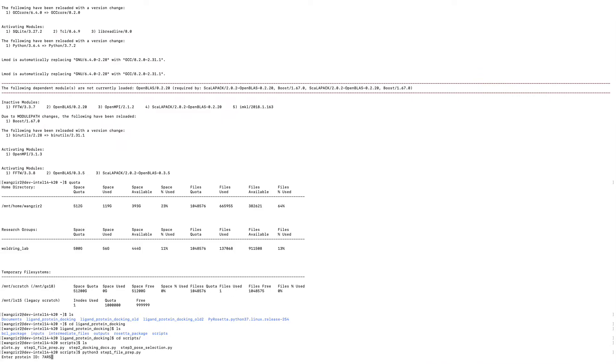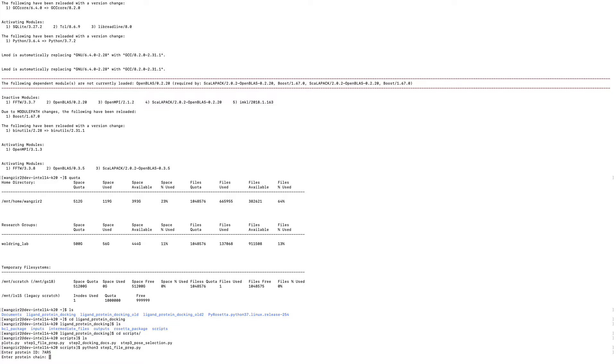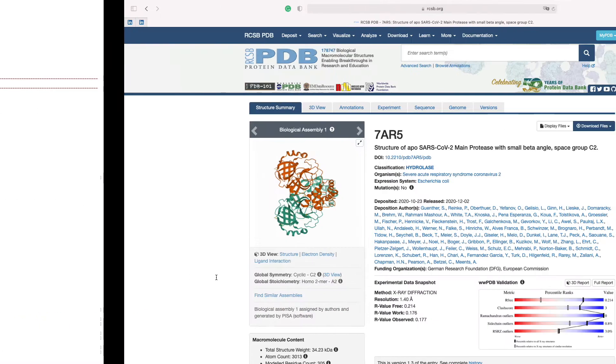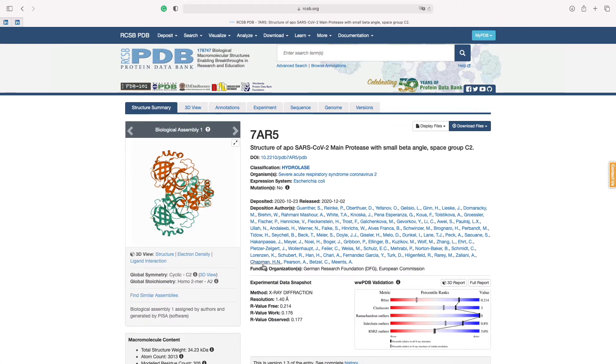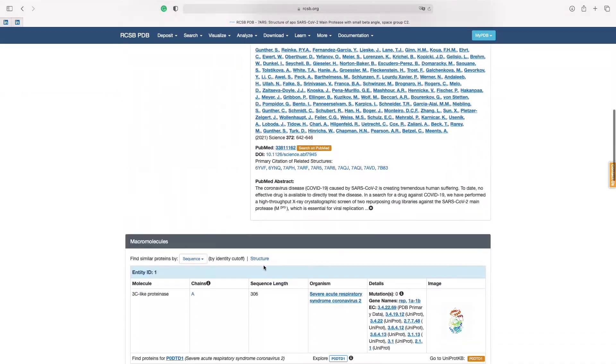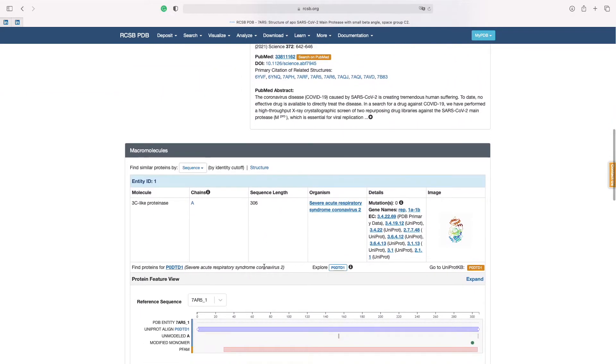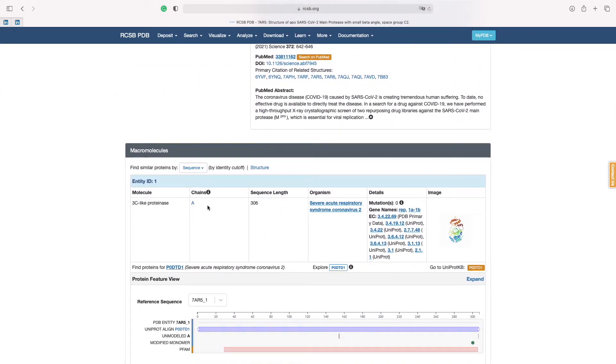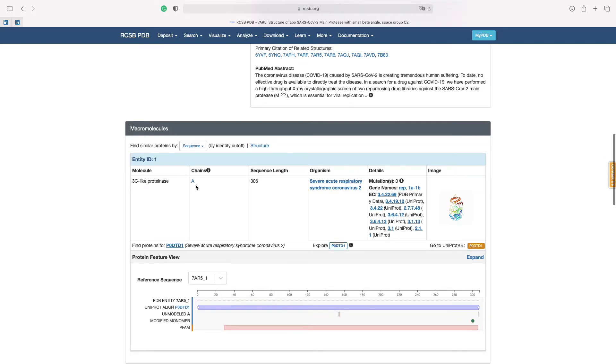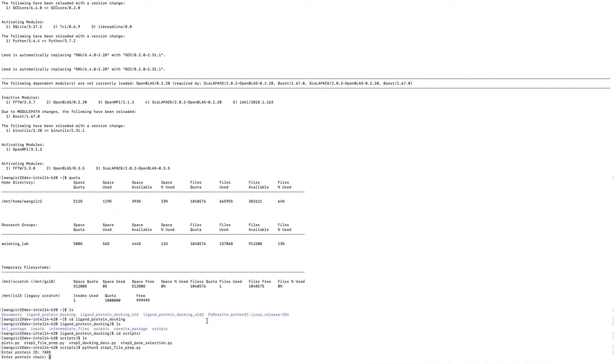7AR5. Sorry. 7AR5. Okay. And the protein chain. We can get this protein chain RCSB. Just scroll down and we'll see the chain information. It's A. Just type A here.